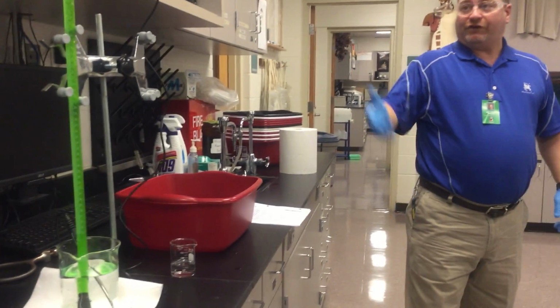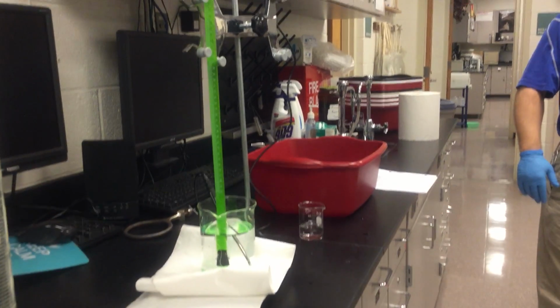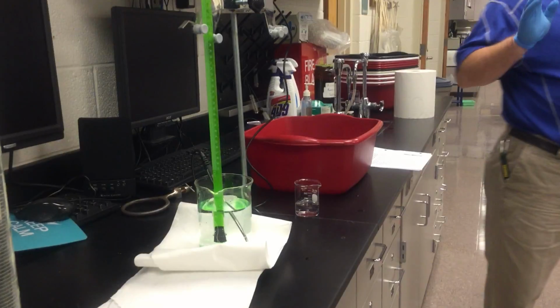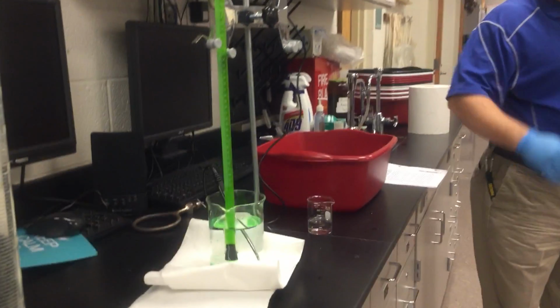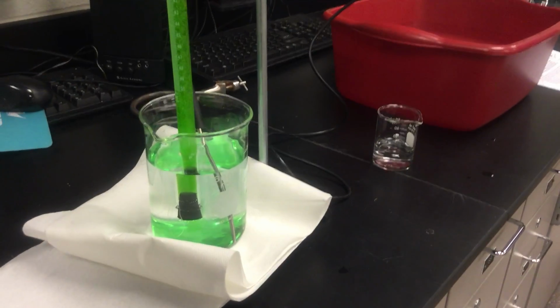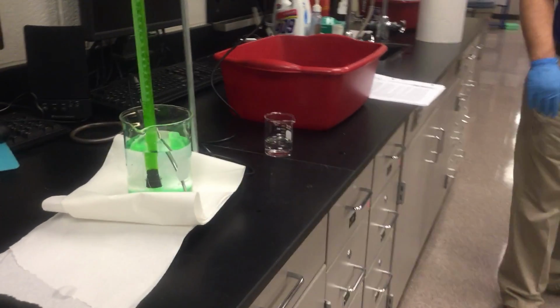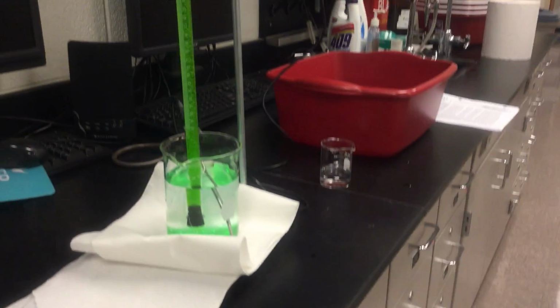So, if you look now, we're going pretty good. Notice the beaker on the bottom. Okay, this is why I love the food coloring. Can you see the water being displaced? Obviously, yeah, because the green's coming out of the bottom of the stopper. So that water's being displaced.